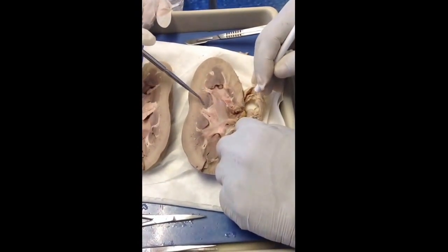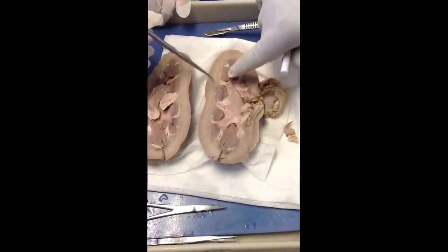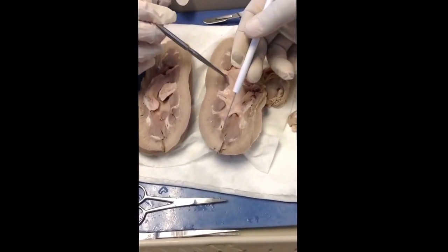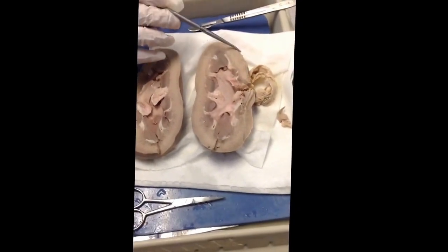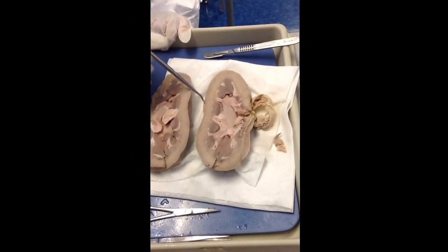So the tongue-looking stuff are your papilla. Renal papilla? Yes. And this, you see, it looks like a triangle, right? That's your pyramid. And this is a whole lobe, with the cortex overlying it.